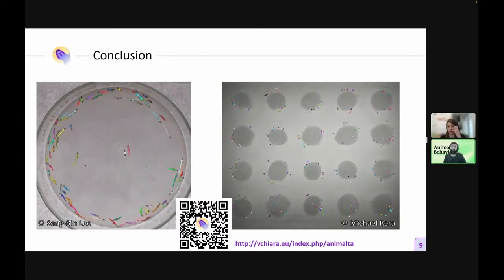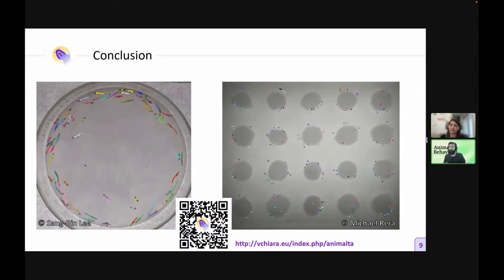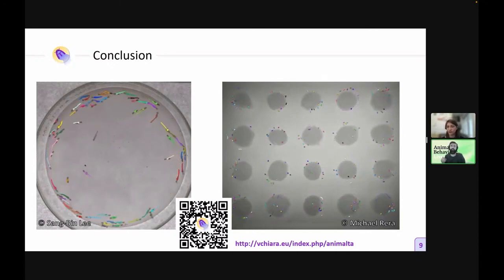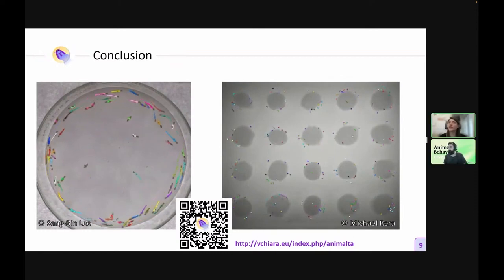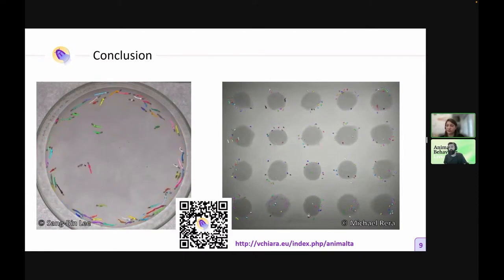Okay, so you already have this hiding zone then. Because of how you explained it at first, I thought that when the software was not able to track, it considered the animal was not in the area. But okay, yeah. No, if it sees the animal entering the arena and leaving it later, it will consider that during all the missing time it was inside.